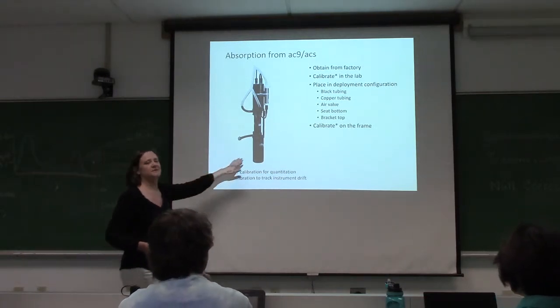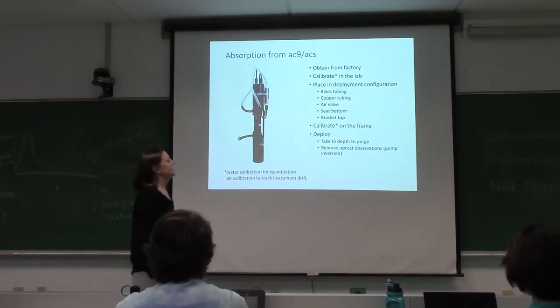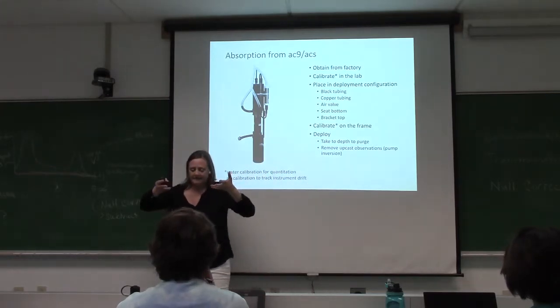But you also wouldn't put your spectrophotometer on a frame, right? You're like, don't touch it. Don't lean on it. Just people are throwing these things around. Okay, and then you deploy it. Take it down to depth. You're going to purge out all the bubbles. You're going to take out that upcast and then start your cast.